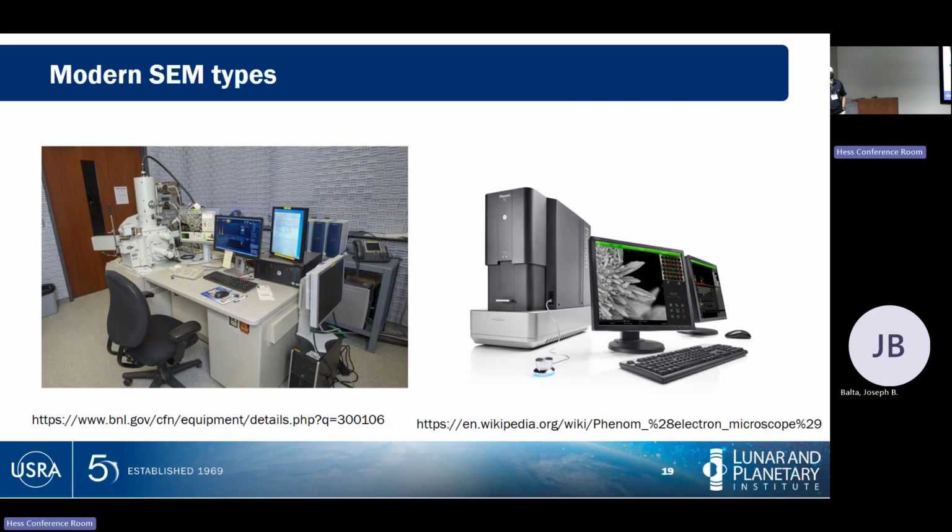When we speak specifically of modern electron microscopy, we're going to see that there's two breakdowns of this right now. The way that engineers are taking this, there is the ultra fancy designs that get put in their own dedicated room, often climate controlled, often sound controlled, to make sure that nothing vibrates in the room. And desktop SEMs, which is technically what we have in this building and what you'll be working with here.